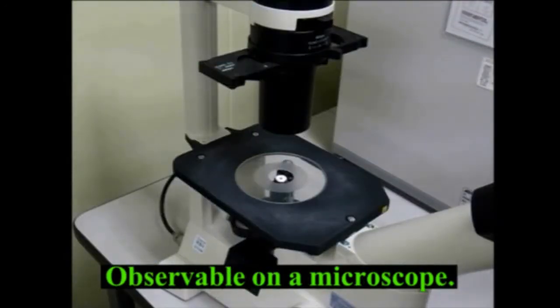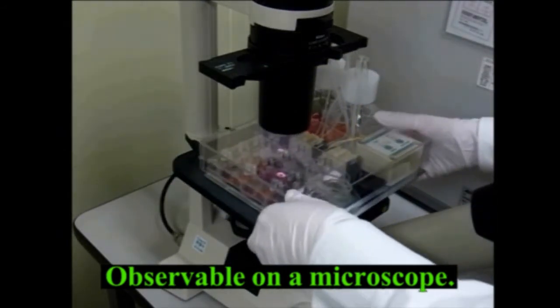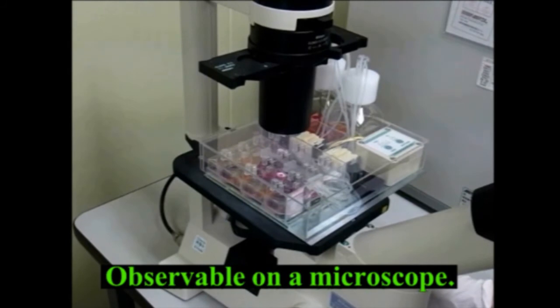And because of the compact size of the entire system, you can observe the cells by directly placing the system on a microscope stage without taking the plate off.